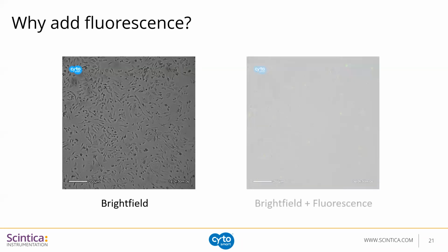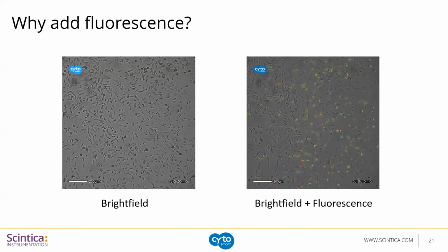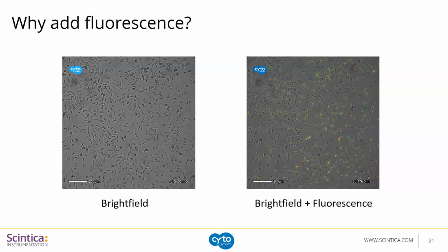If we then watch the same video incorporating fluorescence, we can actually get quite a lot more information out of the same data. So this group in particular was studying CHO K1 cells immediately after some sort of treatment. And cells that display green fluorescence are undergoing apoptosis, whereas red fluorescence in the nucleus indicates that the apoptotic pathway is completed. And images were taken every 10 minutes for the same amount of time.